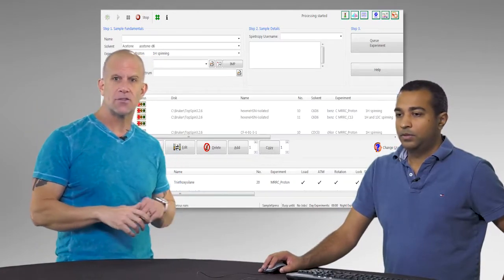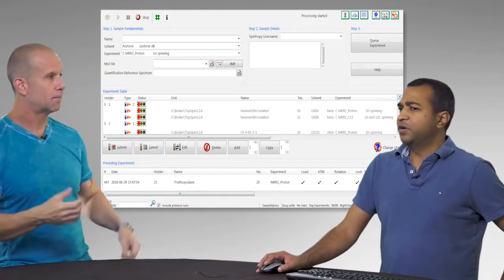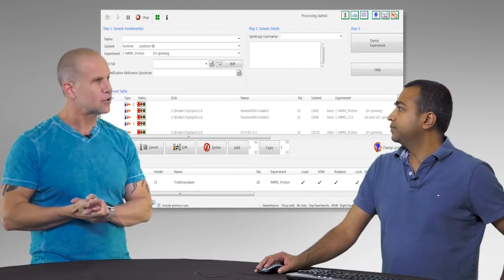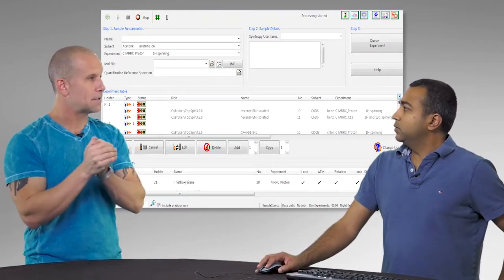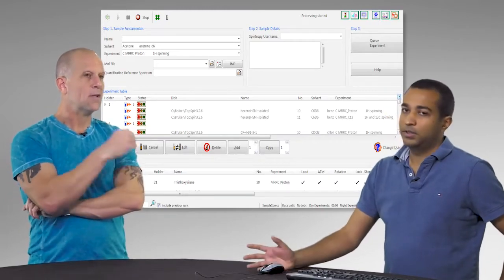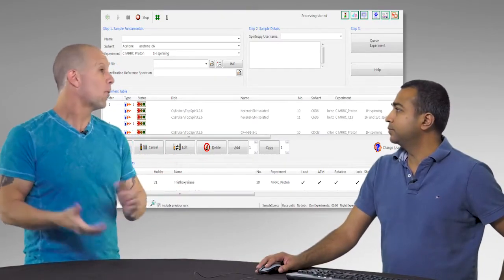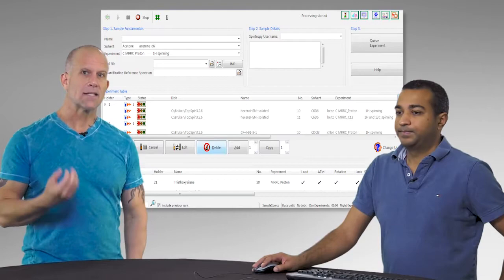And then the bottom window is just what has been run, and if you double click anything there, it pulls up your data in TopSpin. The data is initially stored locally on the computer they're entering, right? That's right. Is it stored there for long periods of time? Is it backed up? Or as soon as you transfer it to the cloud, does it get deleted? No, it stays on the computer, and we just do that for data redundancy. So if absolutely necessary, they could come in with a flash drive and pull off their data later. However, the whole point of this in automated mode is that they don't have to. Okay, so let's walk through.